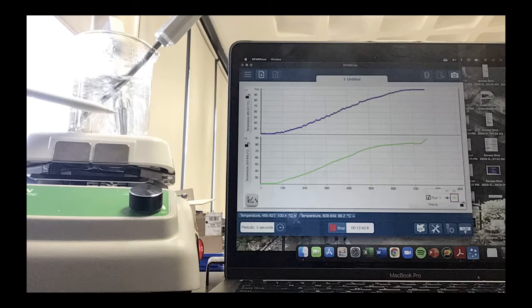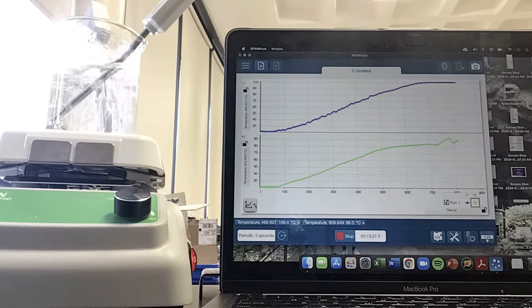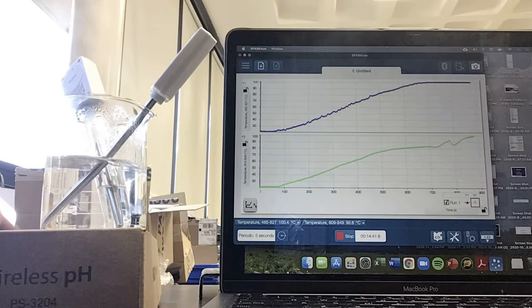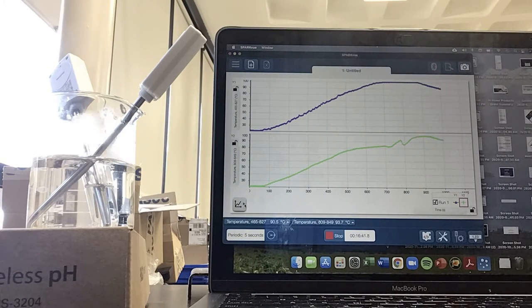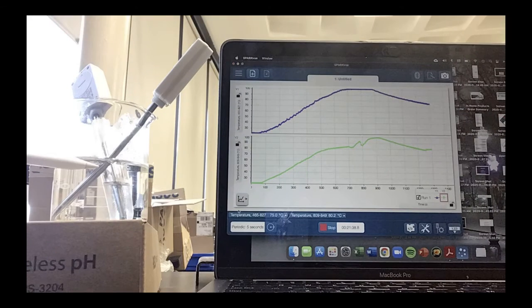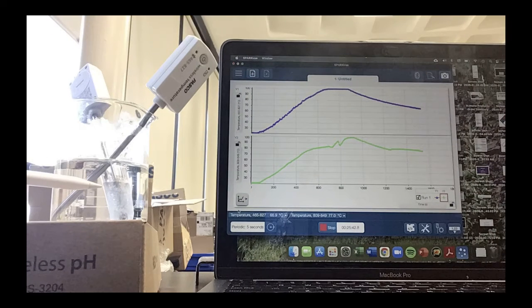We have a little situation where there was a chunk of solid that fell off the test tube and created a little hiccup in the graph. But eventually we got it fully melted, transferred it over then off the hot plate to let it cool. And the substance cools off until eventually we reach a point where we notice some crystals start to form. And once again, the temperature graph plateaus in the unknown while the water continues to cool. It sits there until it reaches the fully frozen condition.